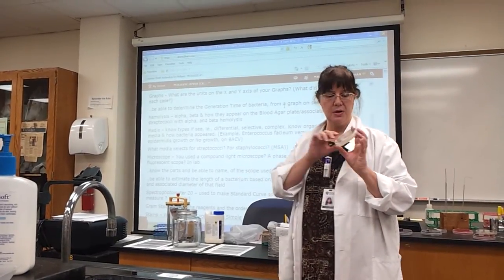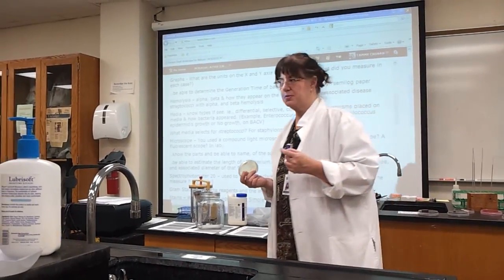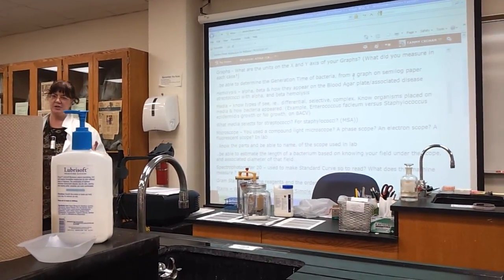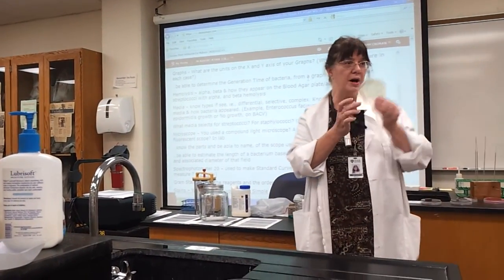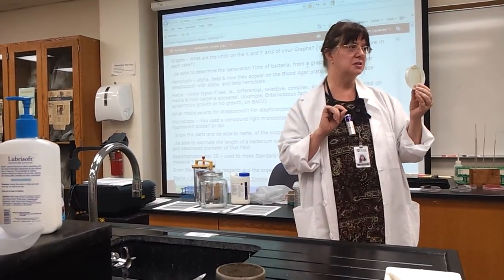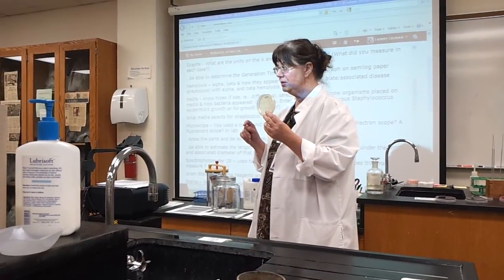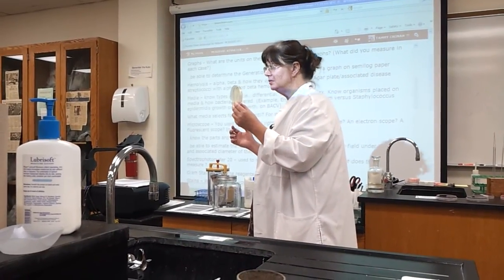In the lab manual. Now, streptococci often are fastidious organisms. I said often, I should say every single one of them. That means they're what? Picky eaters. So if you have a picky eater, do they tend to grow as well as something that will eat everything? No. One of these types of organisms is opaque in the colony and one is translucent. Who's opaque? Staphylococci. The streptococci/enterococci are picky eaters, so they give you translucent, which is less heavy growth.